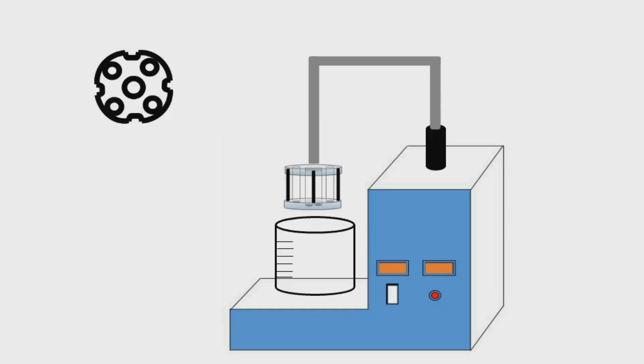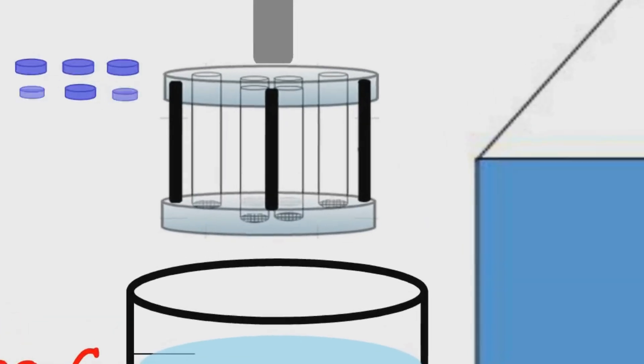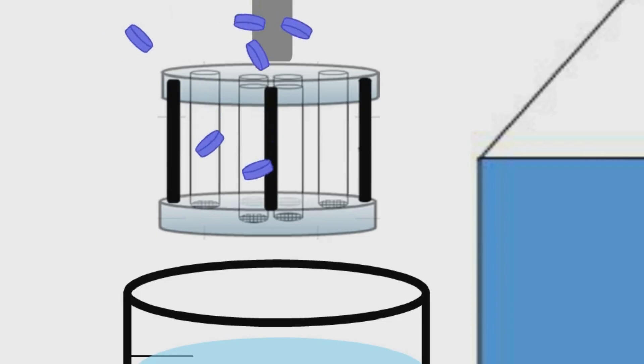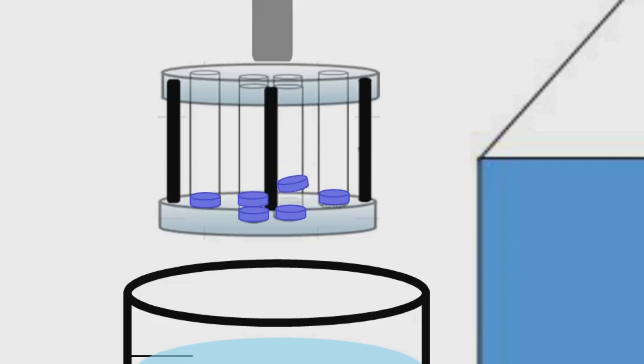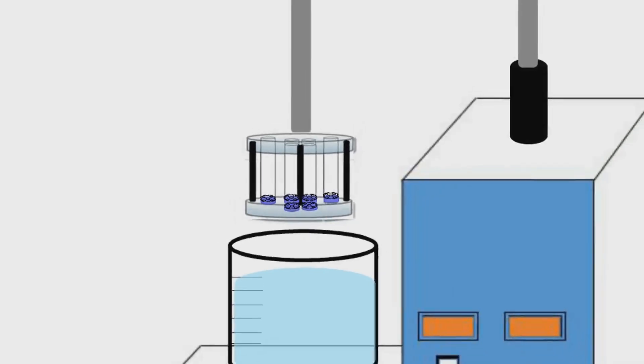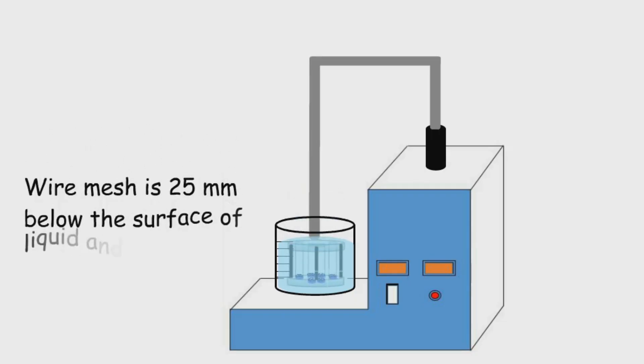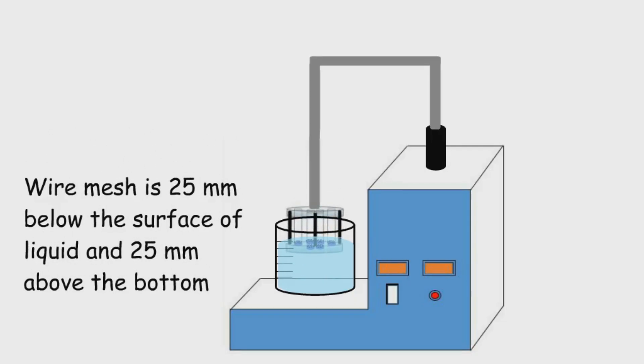Now let's see how this test is performed. We fill up the beaker with the media specified for the test in the monograph and heat it to 37 degrees Celsius. Then from our lot of tablets we take six tablets and put one in each of the six tubes. We then put one disc on each tube over the tablet and start the disintegration test. The basket rack assembly moves up and down so that the wire mesh at the bottom of each tube is at least 25 mm below the surface of the liquid and 25 mm above the bottom of the beaker.